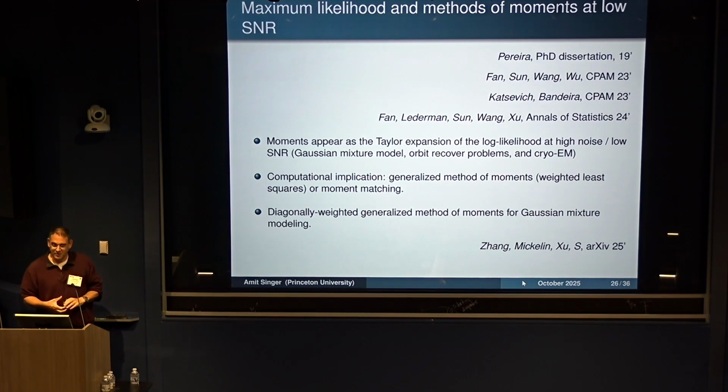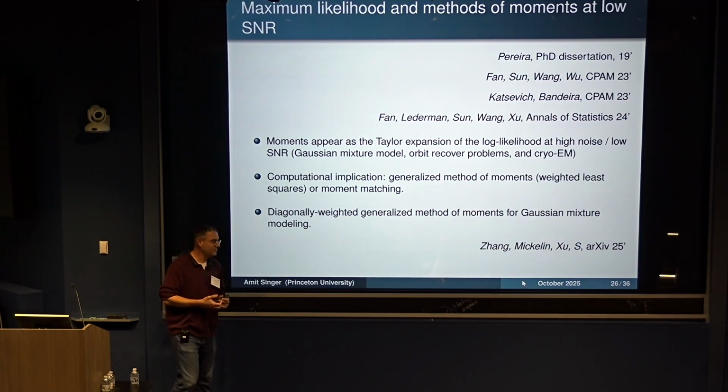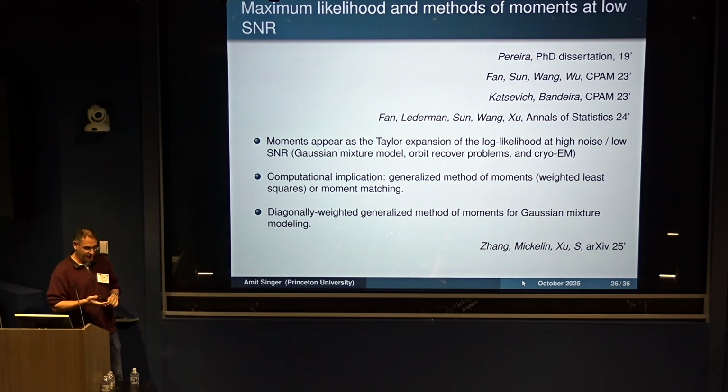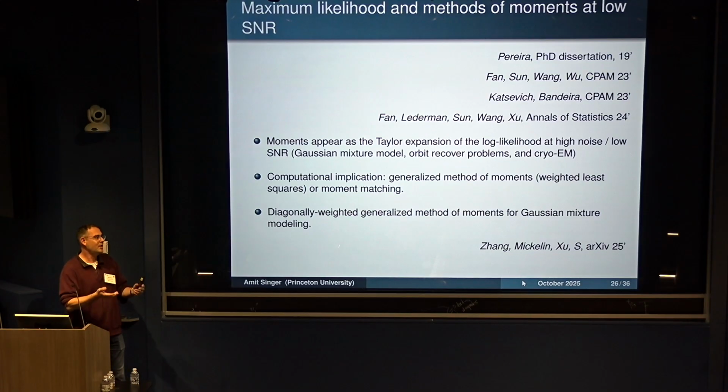Before we conclude this part of the talk, I want to say a few words going back to the optimization that I talked about, but also some take-home messages beyond cryo-EM. I told you about maximum likelihood that everyone uses as the workhorse in RELION and CryoSPARC, and I told you about the method of moments.